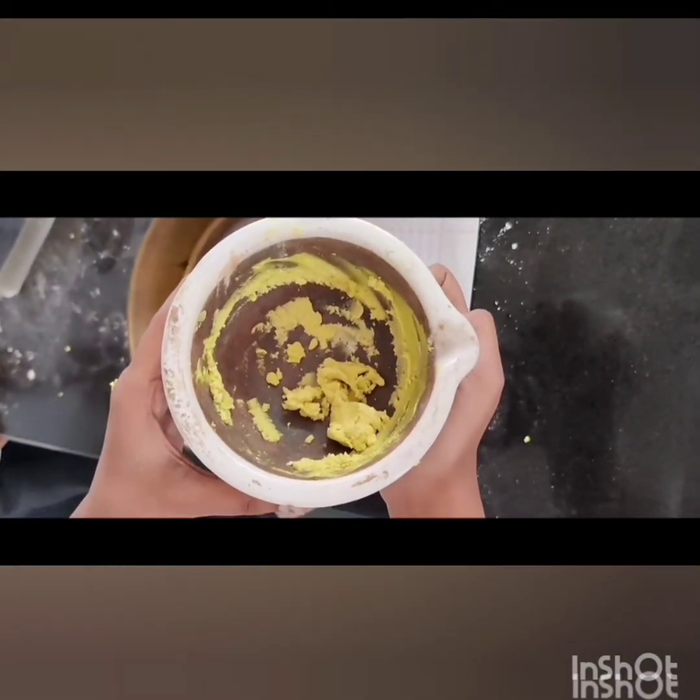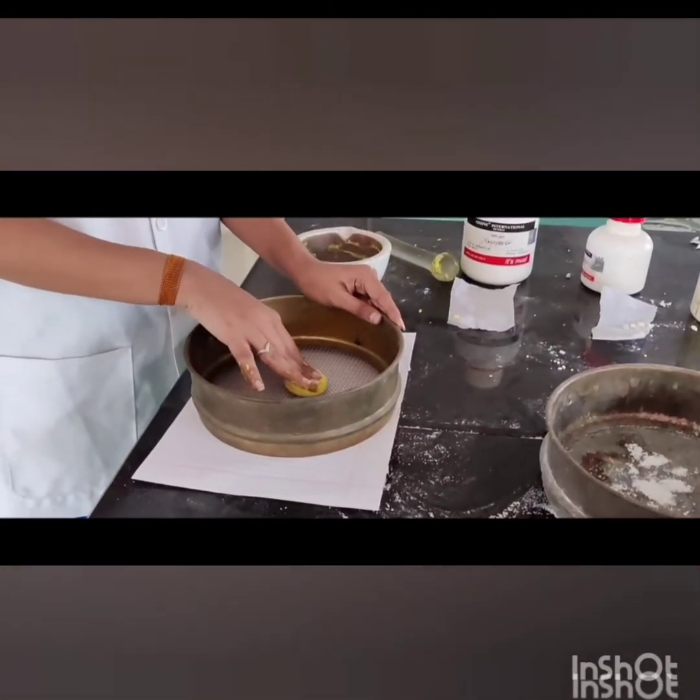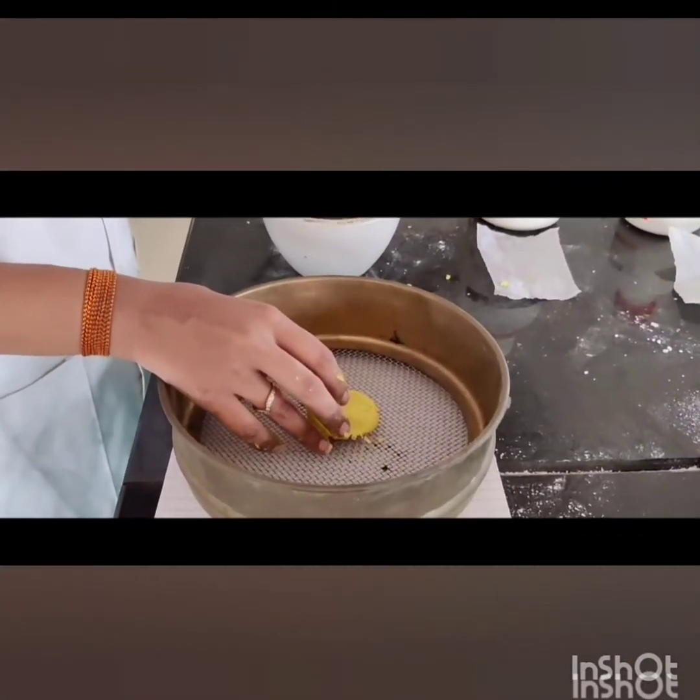After mixing all this, a dough is formed. We have to pass this dough through a mesh.